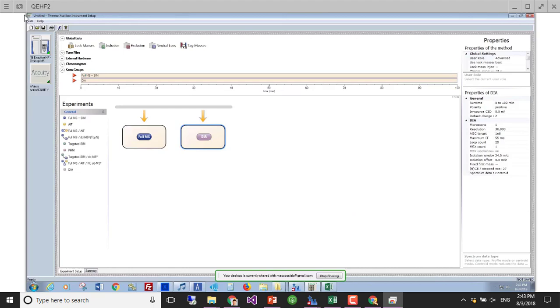The thing that you would have to do after this point is set up your LC system to be able to actually inject ions into the mass spectrometer, but that's going to change depending on whatever system you've got and whatever gradient you think is appropriate for your data sets. Okay? Does that seem pretty understandable? Do you guys have questions about setting this up so far?